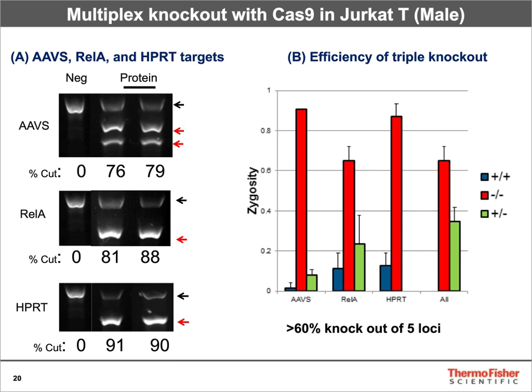Most complex diseases involve multiple genes. So in order to create these complex disease models, it's very important to have an efficient mechanism to create these knockouts in parallel. So with the Cas9 RNP system, you're now enabled to generate knockout cell lines in parallel for the different genes of your interest or choice.